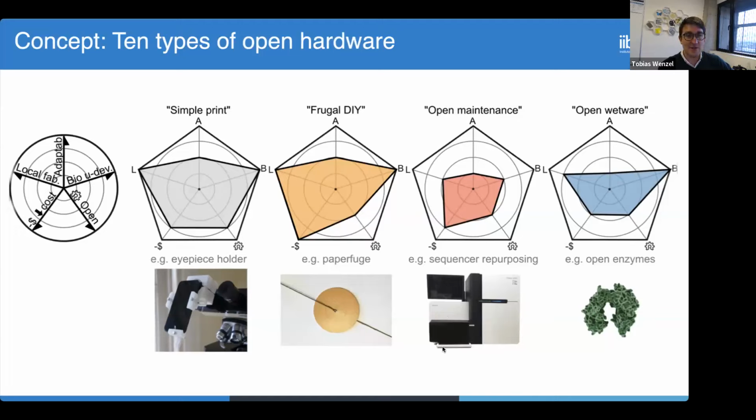So they made a hack of the system to use the pumps and liquid control and fluorescent readout laser systems that are all inside this fancy machine and the computer to really make a fluorescent staining and washing microscope that can scan large samples. So it's a really, really fancy, useful new tool they made out of this very expensive sort of trash thing that sits in many places of the world. Very nice example, but I don't normally work on these kinds of projects.